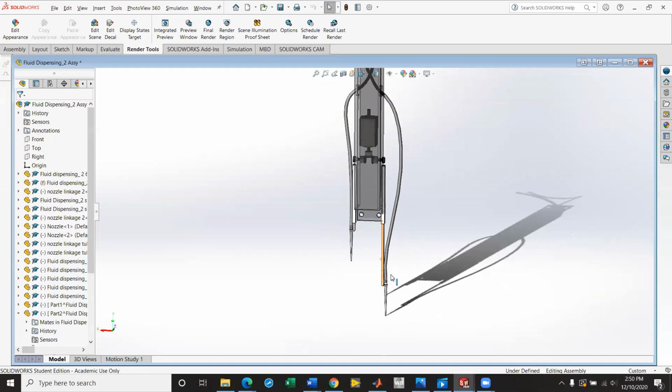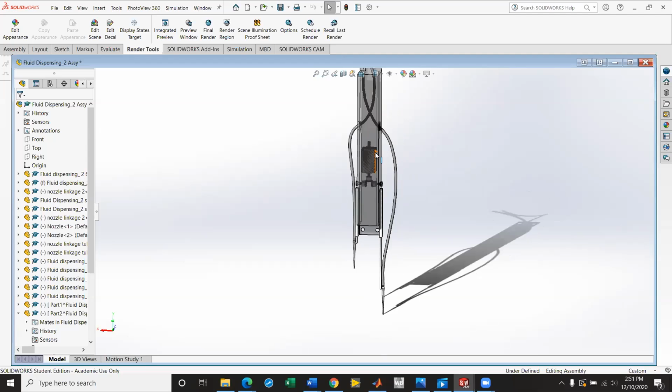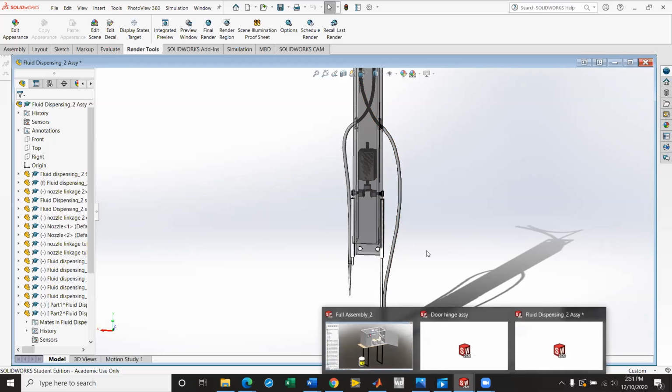So I guess we could say this would be disposal, for example, and we have the container full of disinfectant solution where the disposal nozzle can actuate over there, dip down into the disinfectant, which is 70% ethanol solution, I believe. Yep. And also sucks them up to just clean out the pipes, or the tubes. And I might add that you can do this with both nozzles because the pumps can work in either direction. Yes, that's correct. The peristaltic pumps are capable of going in reverse, so either of these nozzles could do that. Then the sterilization fluid would be some ethanol solution.